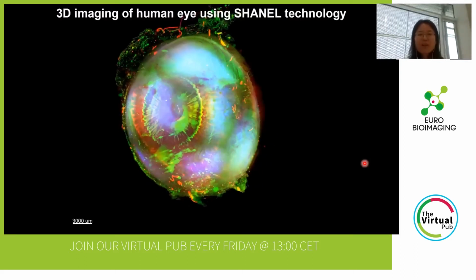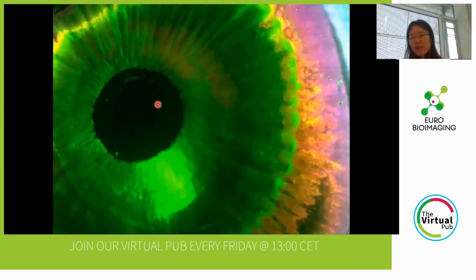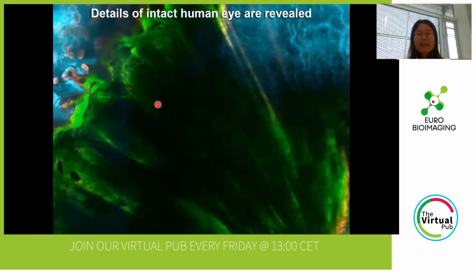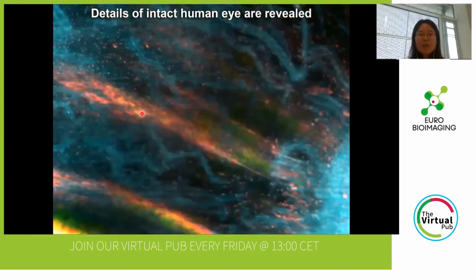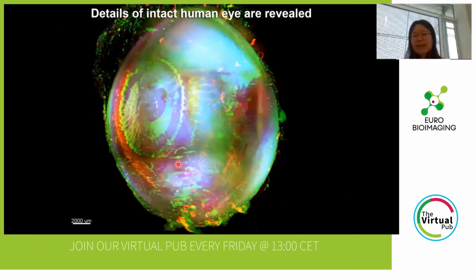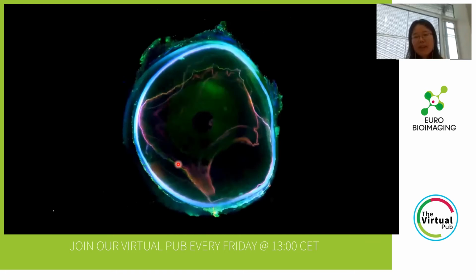So first, here I show an example of a human eye we imaged. This human eye shows the iris, which is the very thin circular structure of the eye, and this is the structure that determines our eye color. It contains a lot of pigments. And when we zoom into the details, we can clearly see the cell nuclei related to the structure. And also we can image the sclera, which is the white part of the eye, and also the suspensory ligament of the eye.